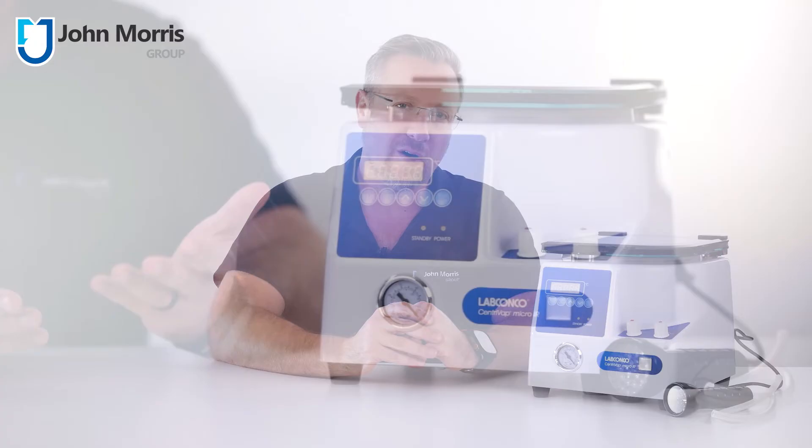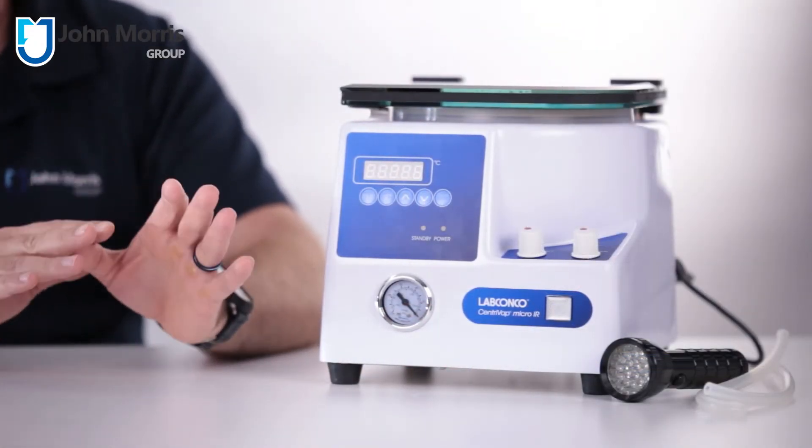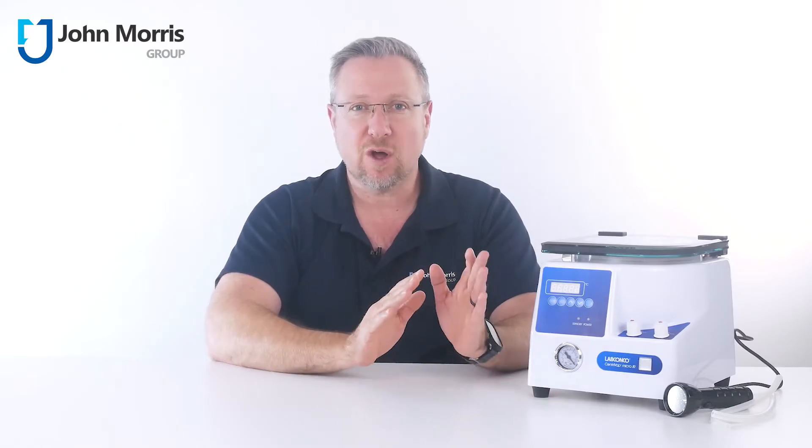There's a range of ways to separate things, and a centrifugal vacuum concentrator separates on the basis of boiling point. There are variations on the theme, but this product will be right for you if you have a small volume of heat-sensitive individual samples and need to remove a liquid, such as a solvent, without either mixing the contents of individual tubes or overheating what remains.